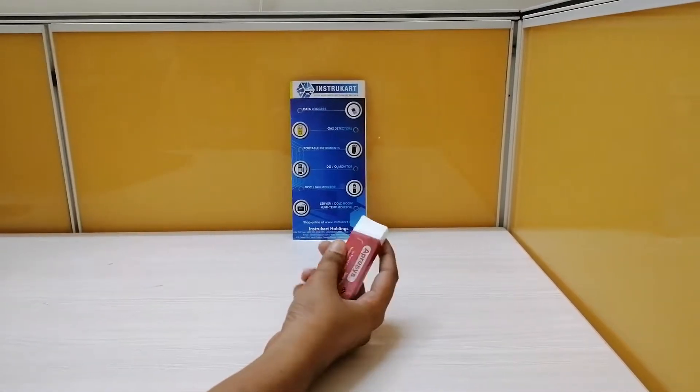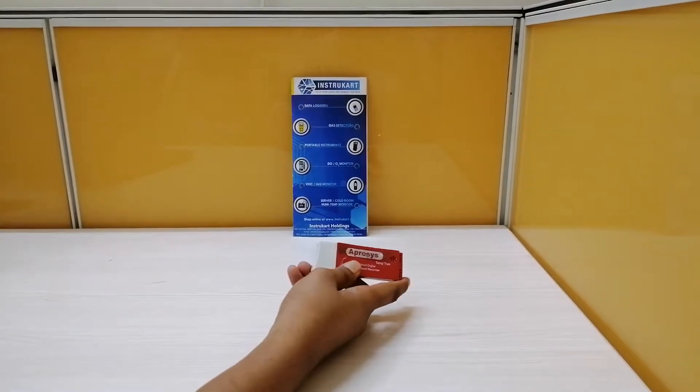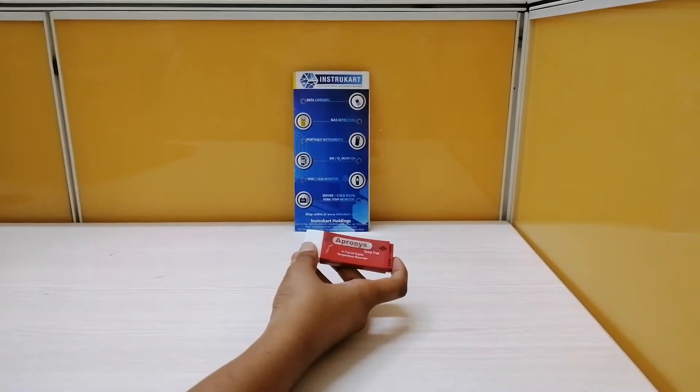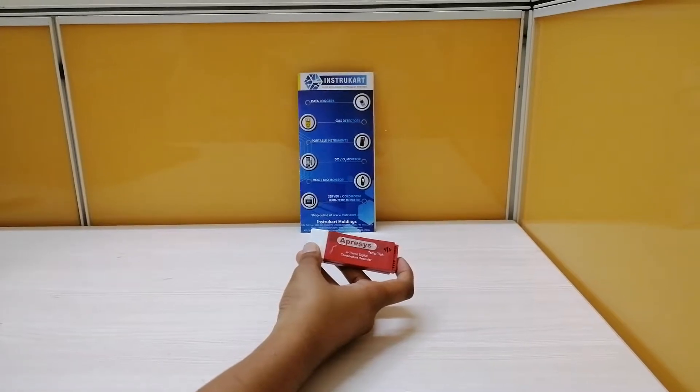This Apresys data logger has a battery life of 2 years. Based on the recording capacity, these are classified into three models.